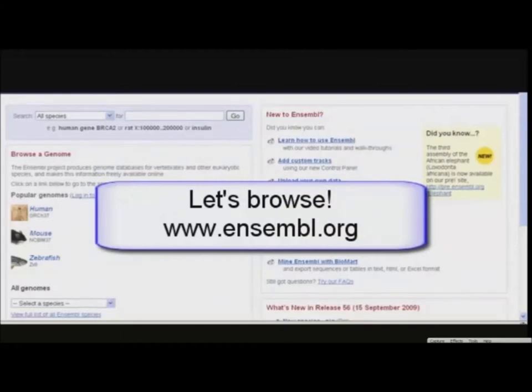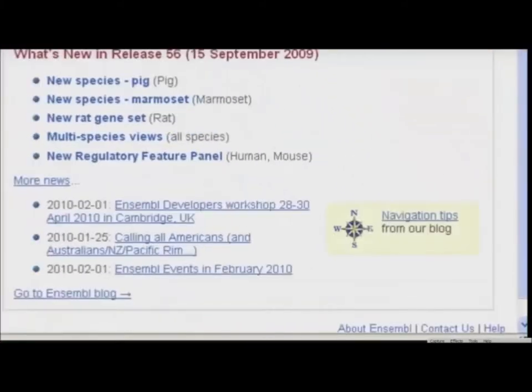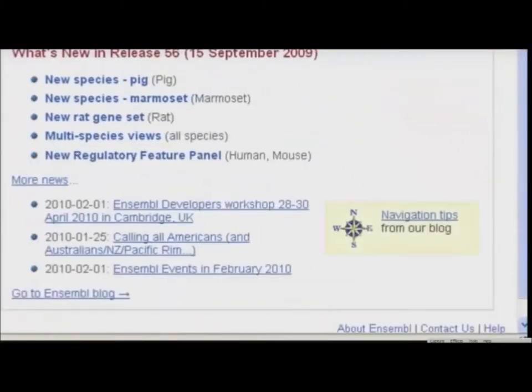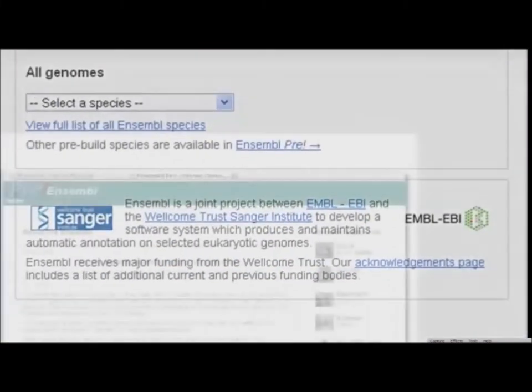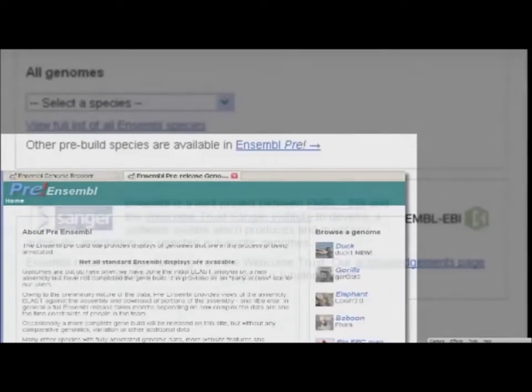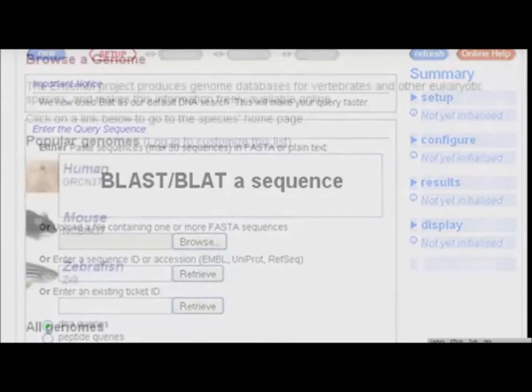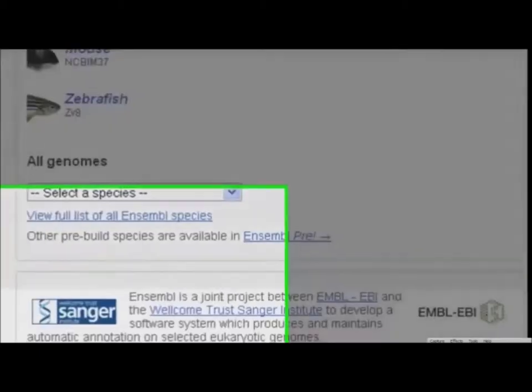Start at the Ensembl main page. Every two months, the browser and underlying databases are updated. The news announces new species, gene sets, and any updates or changes in annotations such as variation mapping. The Pre tab allows you to browse new genomic assemblies that have not yet been fully annotated. BLAST is available on both our main site and the Pre site.